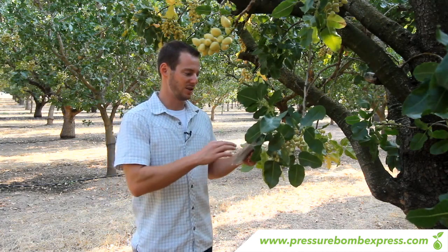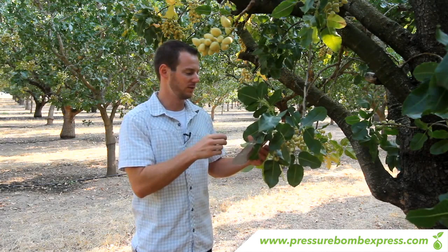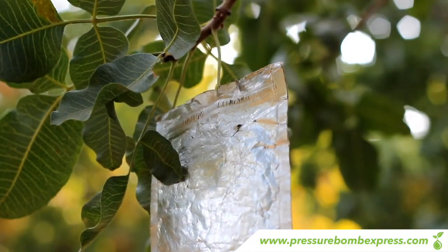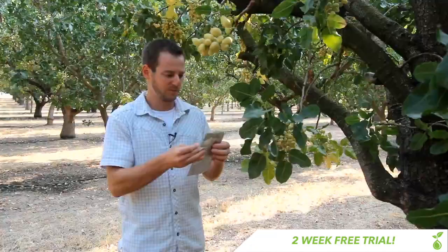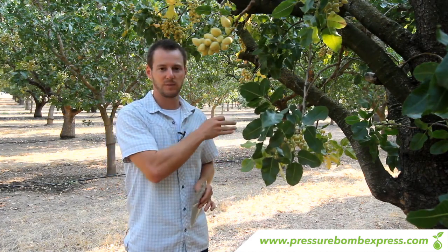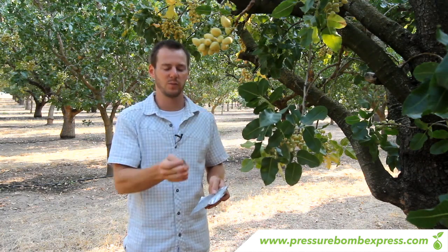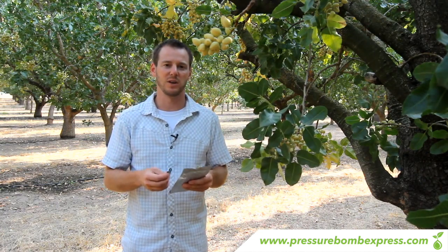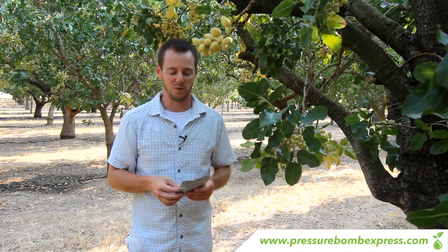After your pistachio bags have been hung for 10 minutes it's time to go collect them. The key with the pistachio is there's not a whole lot of stem here, so you need to make sure you cut as much stem as possible. When you come in, take your razor blade, get as far up the stem as possible, and make your cut. I like to collect three of them, go back and pressure bomb those three, then once those are done move to the next row and collect the next two. It's best to not have them sitting around too long before you pressure bomb them.